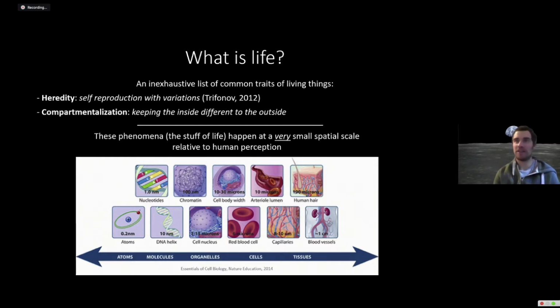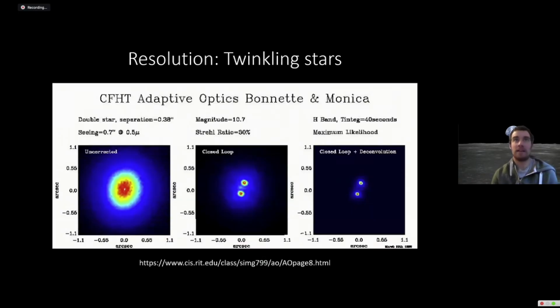Where a human hair is maybe 0.1 millimeters or 100 microns, a blood cell might be 20 times smaller than that, and a nucleus might be smaller than that, and then the other constituents of cells might be even smaller. And the synapses that Uri was showing are much smaller, maybe 100 times smaller than a nucleus, 1,000 times smaller than a nucleus. And we'll get to that in a second.